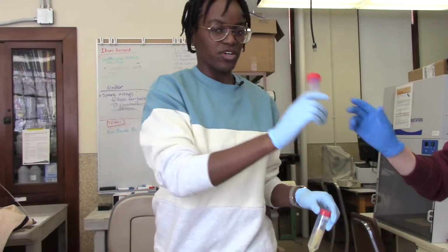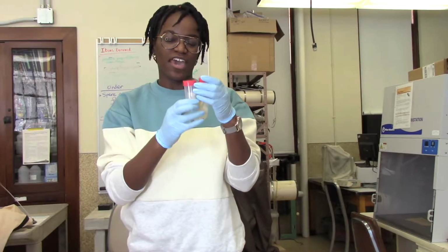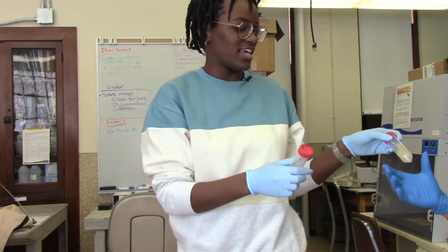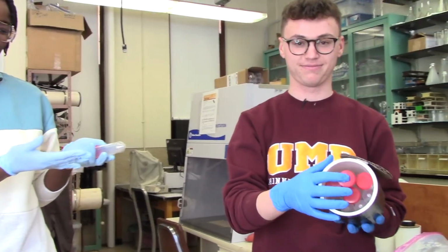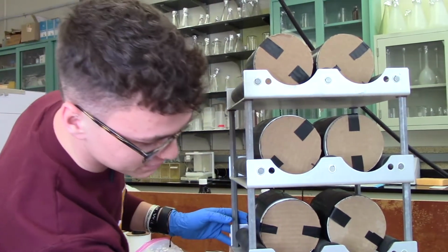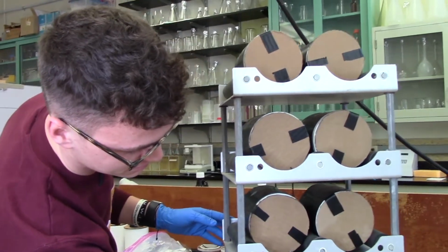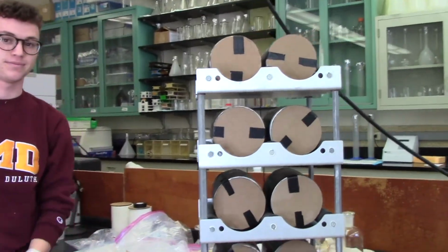So we take the small amount of sediment, add some liquid and the resin strips, and then we load them up into the hedgie huts. We call them hedgie huts because I have a hedgehog and he would love to sit in there. We put them on this roller and we turn it on, and then we allow the extraction process to go on for about 16 plus hours.